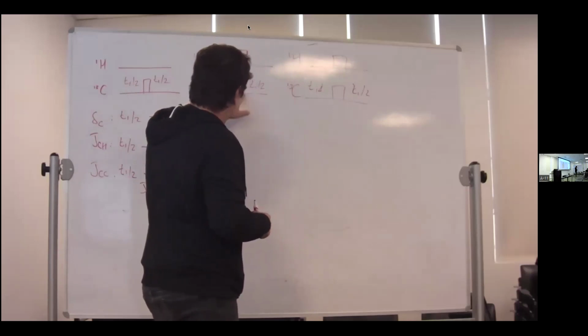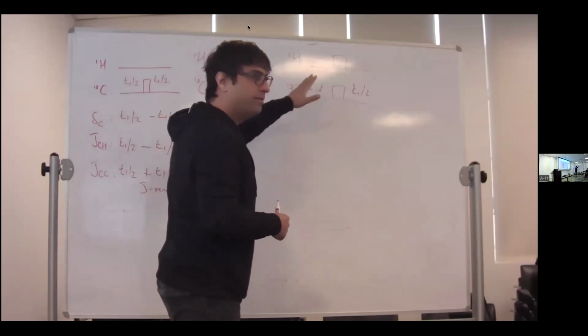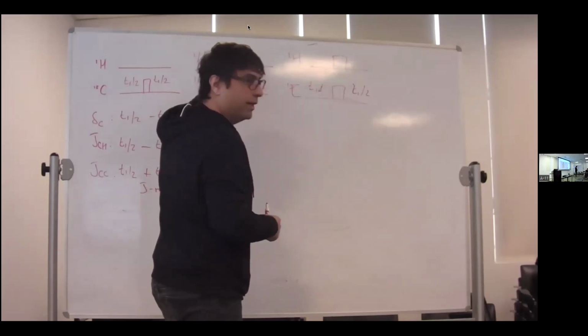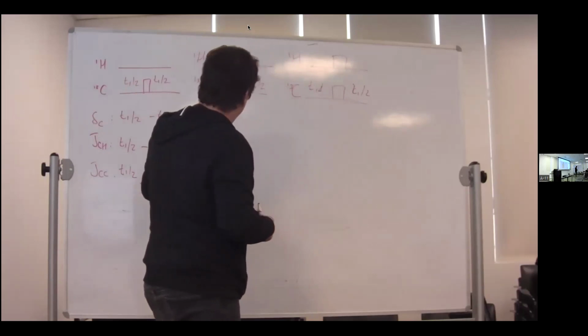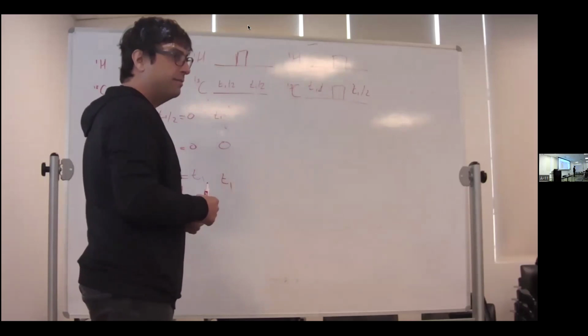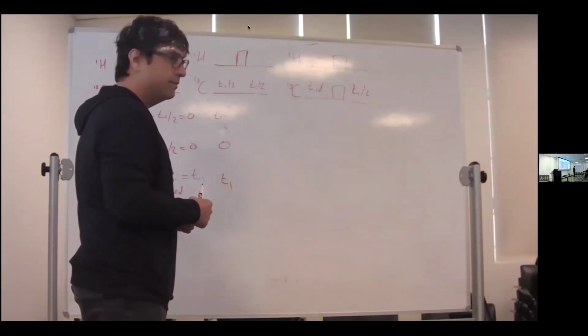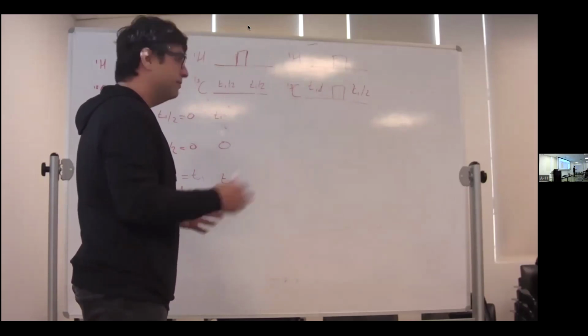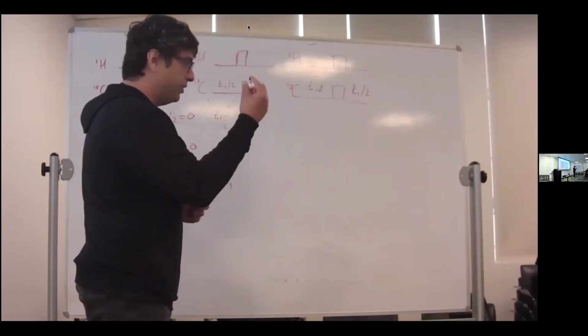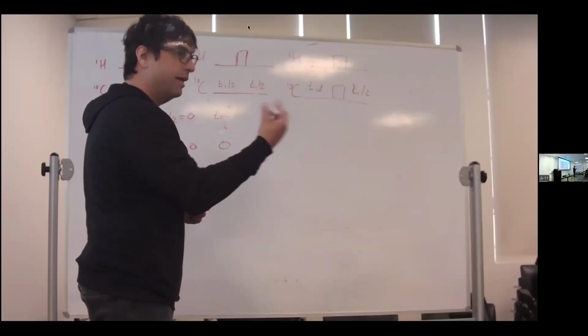So here, because we allow chemical shifts to evolve, no problems for the full period. We're getting rid of CH coupling by decoupling the protons. But then the CC couplings evolve. So when I Fourier transform this, what am I going to get? A doublet centered on the carbon. Yeah, so I'm going to get a regular HSQC, in which every peak is a doublet in the indirect dimension.